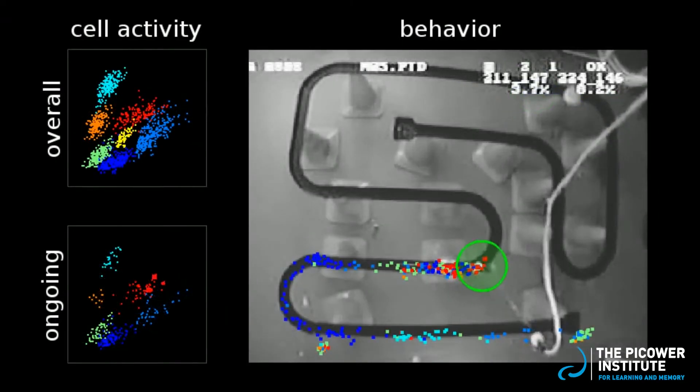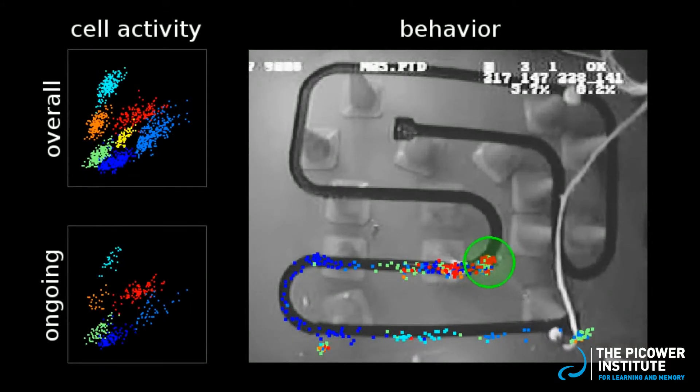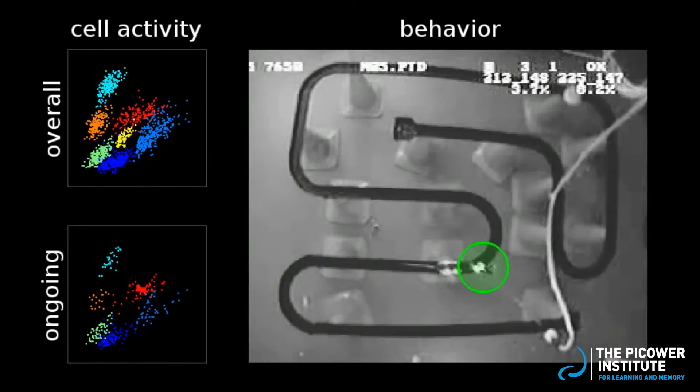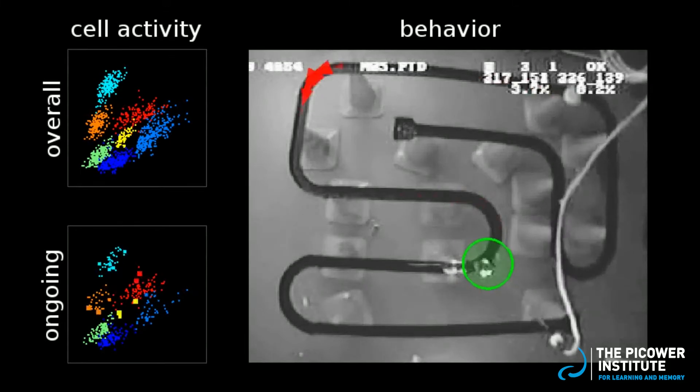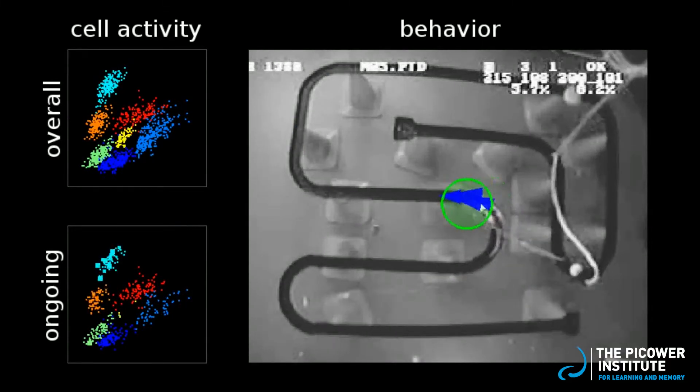When the rat stops on the track, you begin to see bursts of the place cell activity, including different colored place cells that don't represent the current location. But if you look at the predicted location of that activity, you find that the hippocampus is replaying place cell sequences from other parts of the track, as if the rat is thinking about those locations.